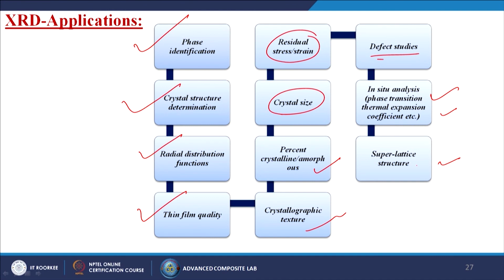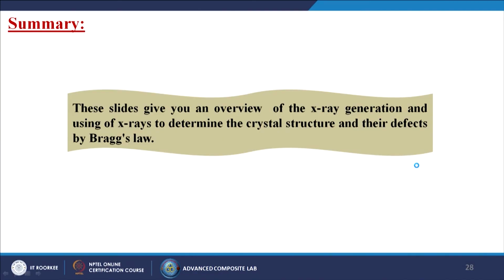And last but not least, the superlattice structure. Now we can conclude our lecture: in this lecture, an overview has been given about X-ray generation and the use of X-rays to determine crystal structure and defects by Bragg's law. Thank you.